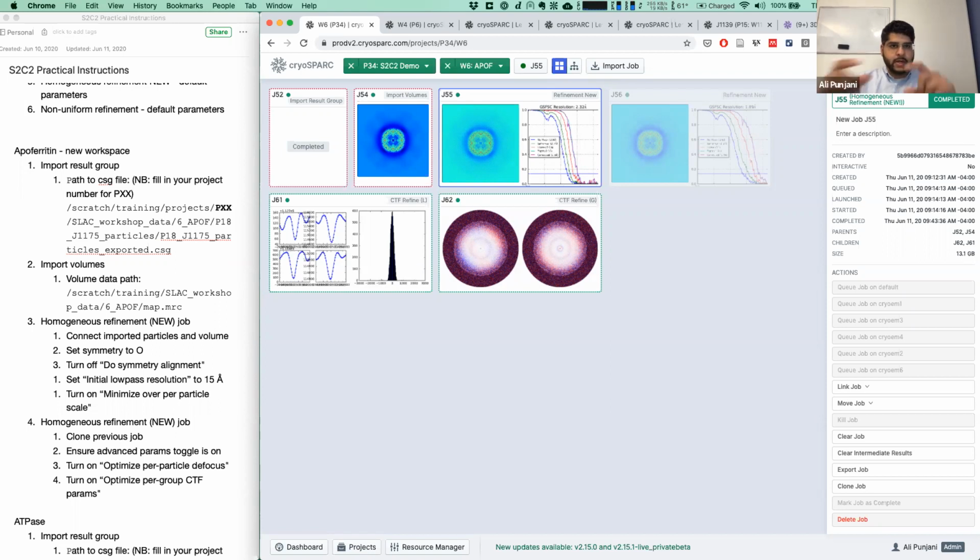If you consider a case where you have ice of a certain thickness and a certain amount of electron dose, the smaller your particle, the less of the electron diffraction is happening in the protein versus the ice, and the less signal you're creating by that electron diffraction due to the protein versus noise in the detector. So with everything else being equal, the particle size exactly modulates the signal to noise ratio.